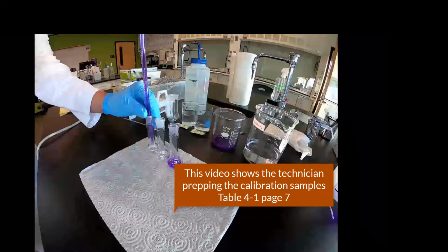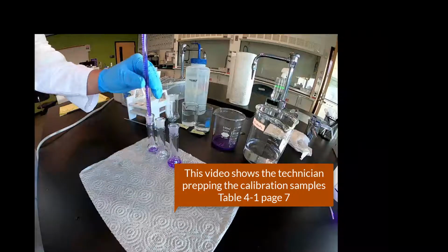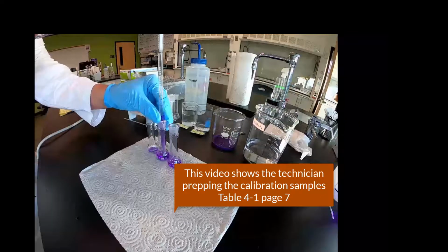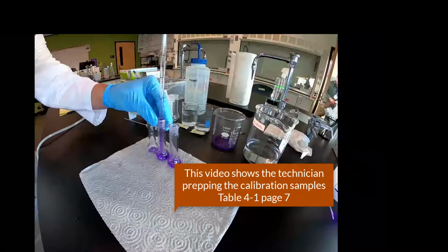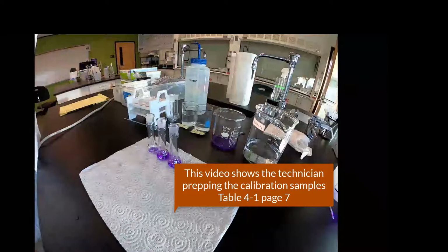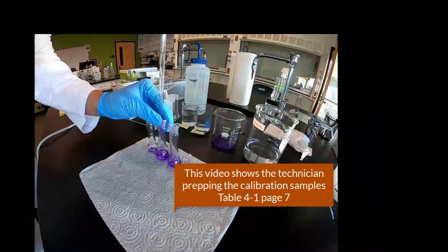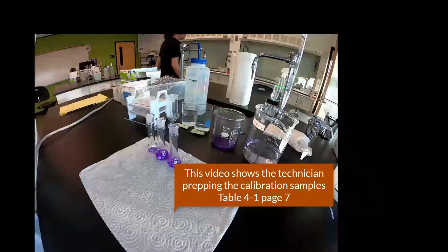So it's going to dispense. And remember, you don't dispense all the way out. You go from mark to mark. So he's going to dispense down to the 5 mil mark. Oh, okay. Maybe working on the lower volume ones. So that might have been a 1 mil, followed by a 5 mil, what I'm guessing, which is a good use of solution. Okay, dump the waste in there.